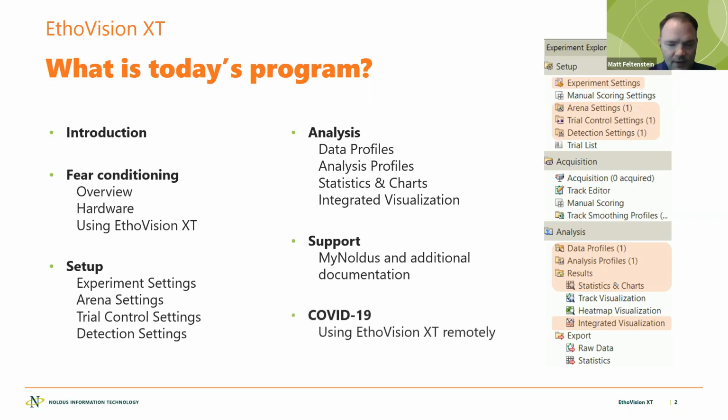And of course, even though restrictions are starting to ease up a bit, I just want to make sure to show you how you can use EthoVision XT remotely if you're not actually able to go into the lab and access the license key or the computer that has it installed. So again, I'll give you a few pointers if you want to be able to access it remotely.